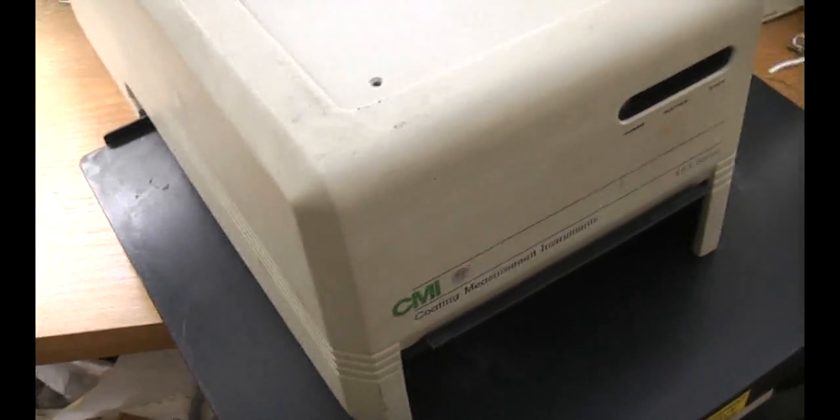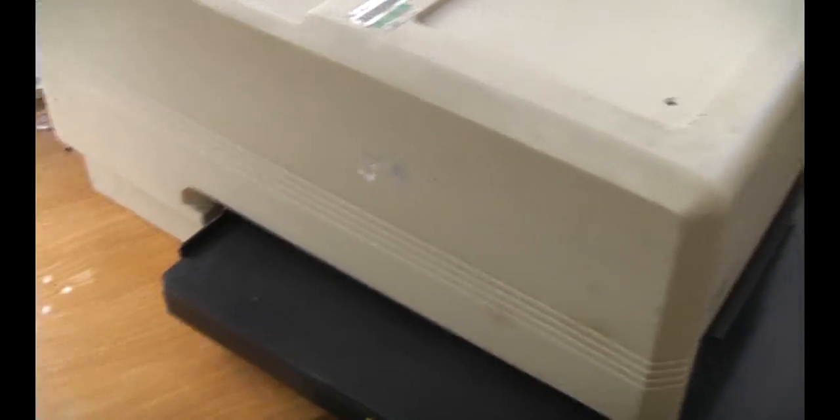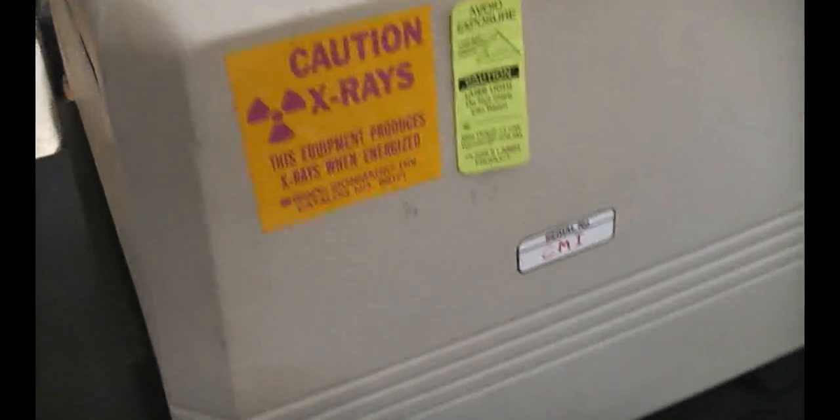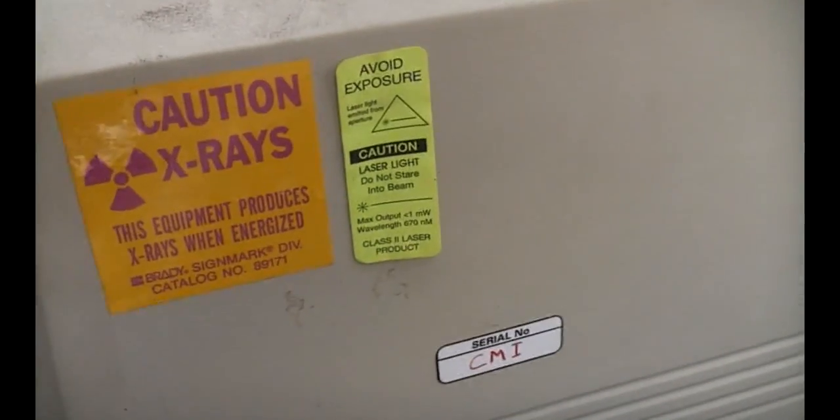There's a video output connector and a little camera inside. There's no realistic chance of actually getting this to do anything useful without the PC and interface card. So it's time to take the pieces and see what's inside. It has a test date of 2002 and calibration due of 2003, so it's probably just sat somewhere for the last ten years doing nothing. The serial number just says CMI - that's probably the company's internal serial number rather than the manufacturer's.